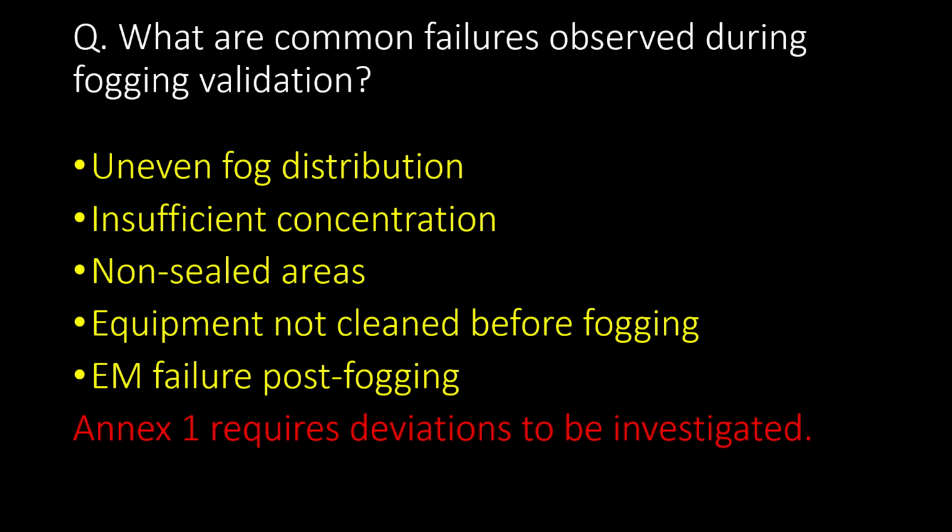Very important question. What are common failures observed during fogging validation? Uneven fog distribution, insufficient concentration, non-sealed areas, equipment not cleaned before fogging, and environmental monitoring failure post-fogging. Annex 1 requires deviations to be investigated.